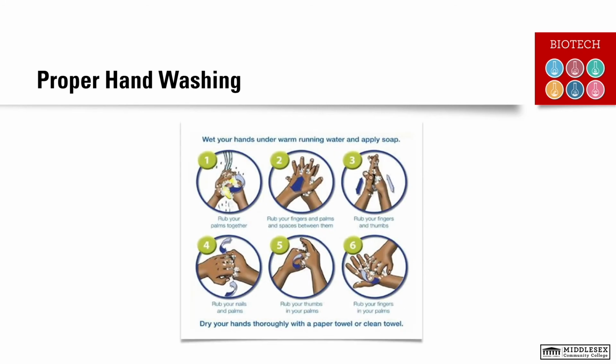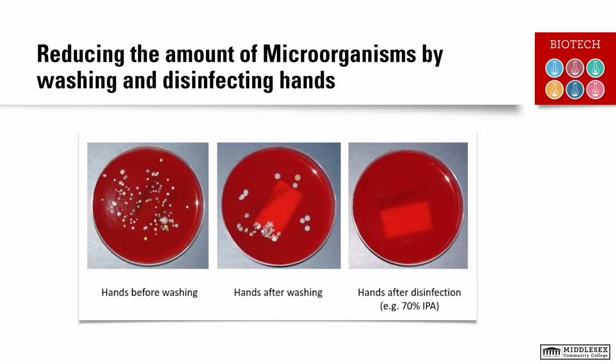You should always follow the signage for proper hand washing technique as directed by the Centers for Disease Control, as this will help to reduce introducing particulate matter into the clean room. This image shows the impact proper hand washing can have when preparing to enter the clean room. Because our hands encounter many different surfaces, we should always wash properly to reduce colony-forming units that may be present.